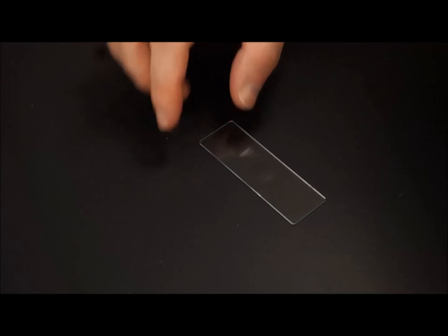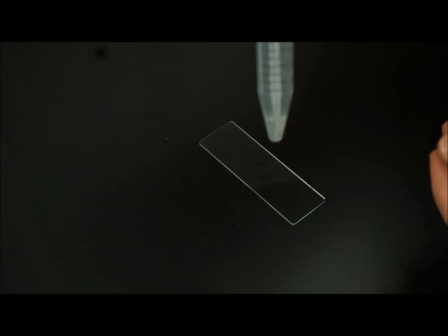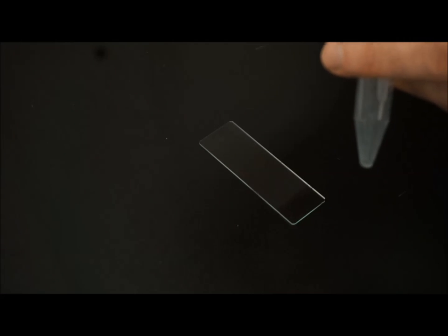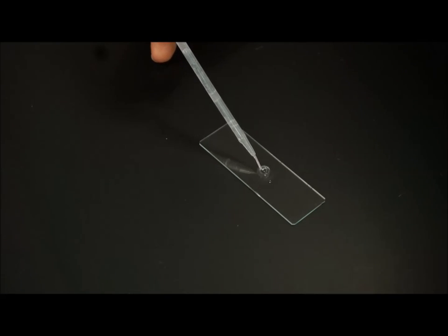Here's our glass slide, and you can see the dimple on top of the slide right there. We'll take our solution of microbeads with a pipette, get a good dose of that, and just gently squeeze that into the dimple.